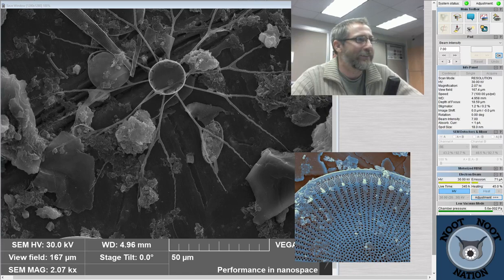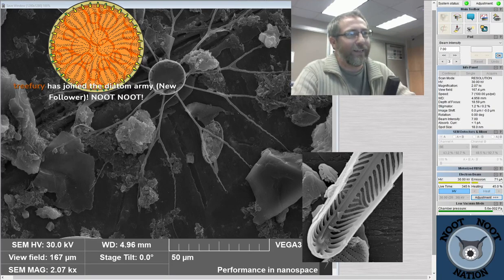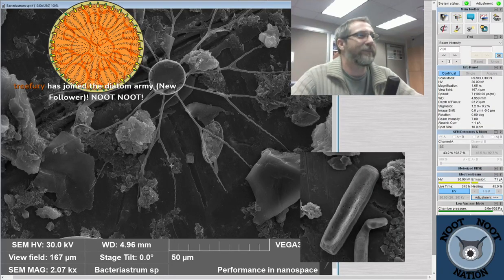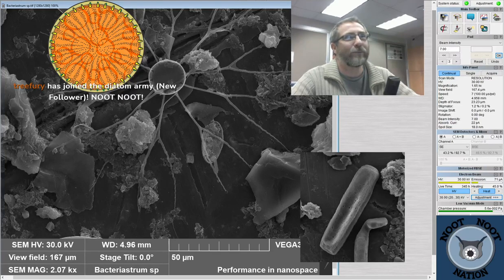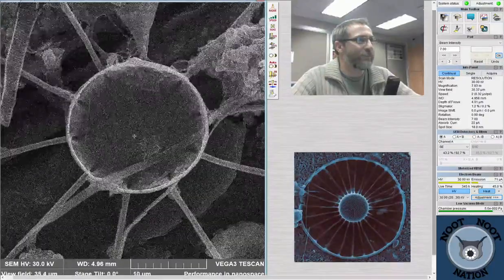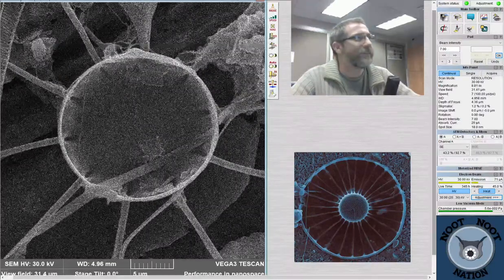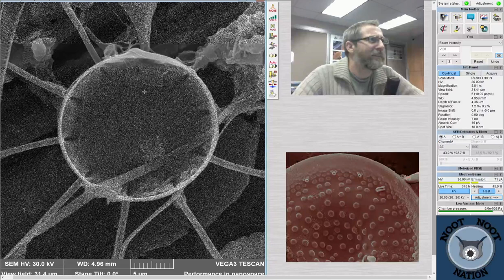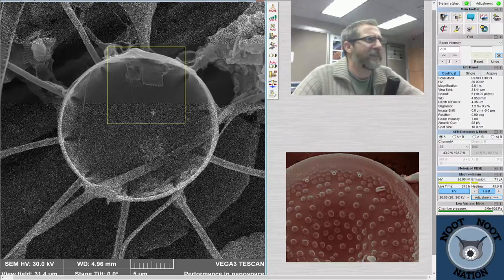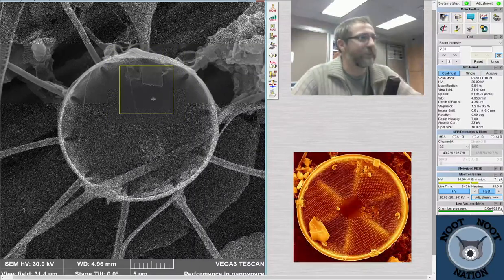I'm going to get a photo and I will color this one and put it on, I'm sure, my Instagram account. I needed to come back and figure out what the name was. Bacteriastrum. And I'm going to zoom in so we can look at the valve face a little on this one too, so we're not just looking at the super distant view. You can have this one where it looks kind of like a clock. And I can set that to 7 and hopefully we can see something. I think it's in focus. It's hard for me to tell. It's really neutral. There's nothing on the valve face that's really clear.